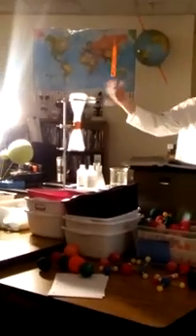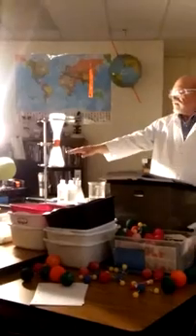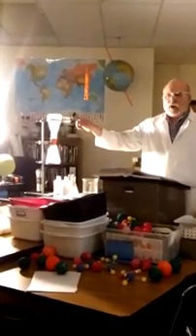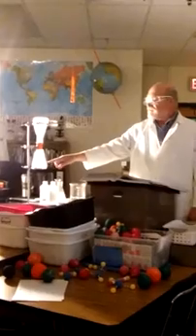So I'm just using what I know about the density of matter to separate the gases based on their densities. The carbon dioxide is probably one of the heaviest gases here. So the carbon dioxide that was in here, probably from all of us exhaling, is collecting down below. Hydrogen gas being formed is rising because it's the least dense.